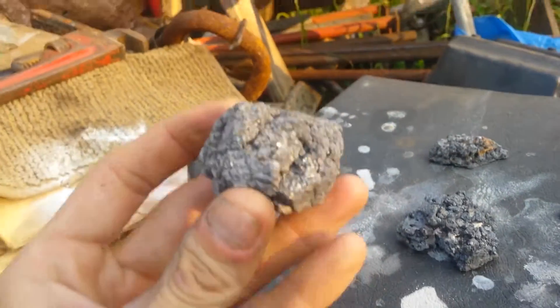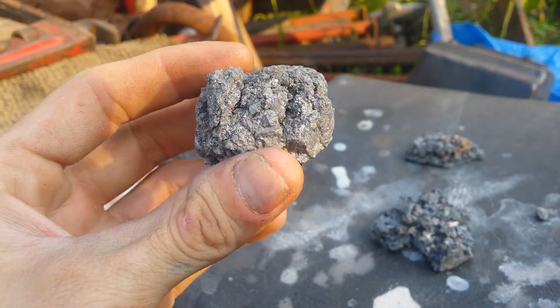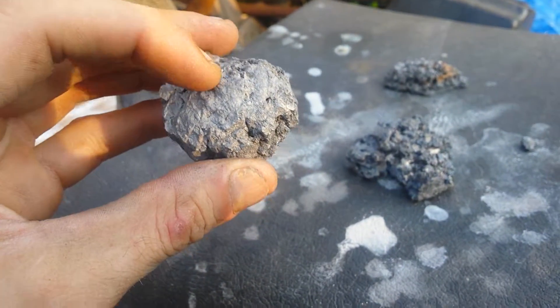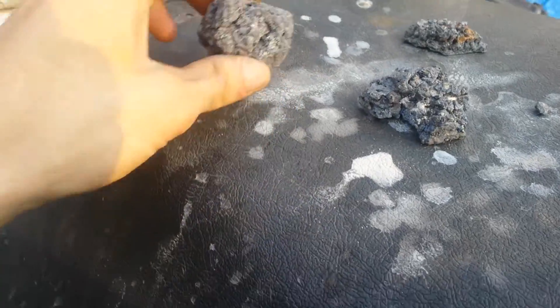My experiment was sort of a success. I'm thinking that sparkly material is nickel and the rest I don't really know. I was thinking cobalt before, but cobalt apparently dissolves in hydrochloric acid and it didn't, so it could be silver mixed with something else still.